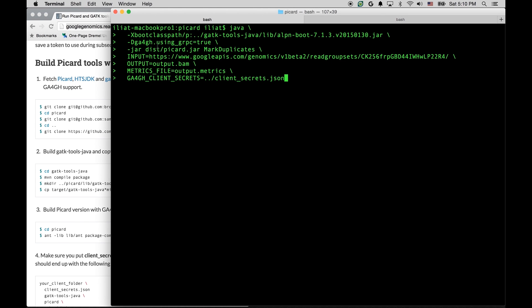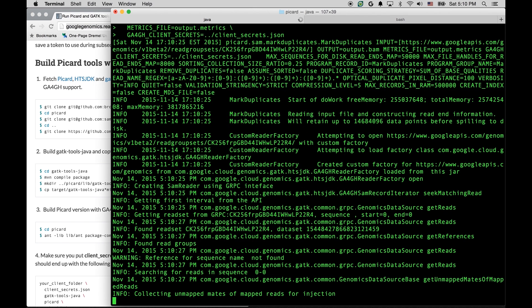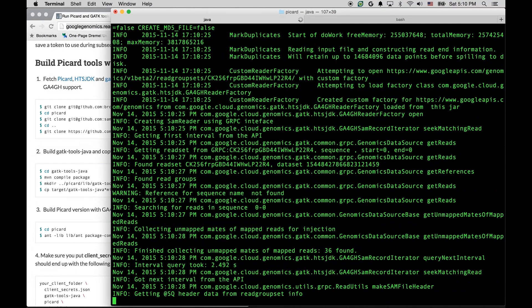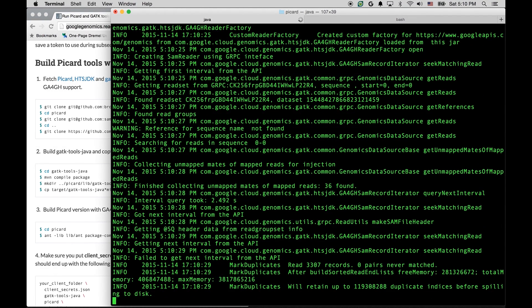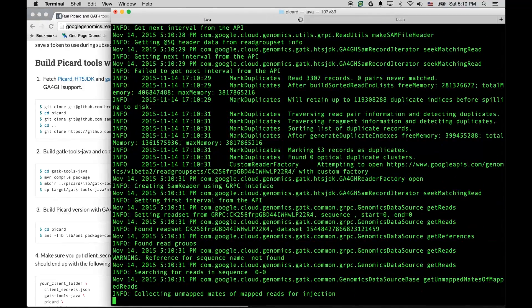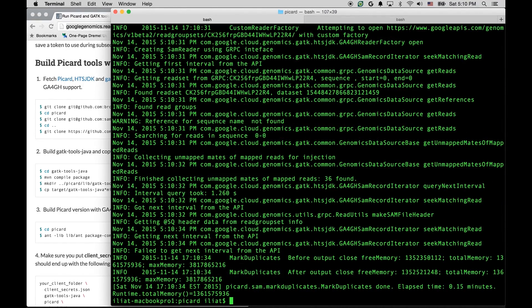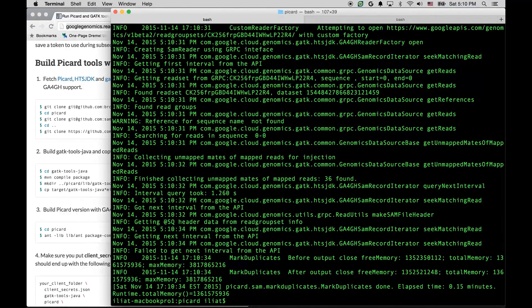Okay, so same Picard invocation, except this time mark duplicates instead of ViewSAM, and the input is again the URL. Again, this worked.